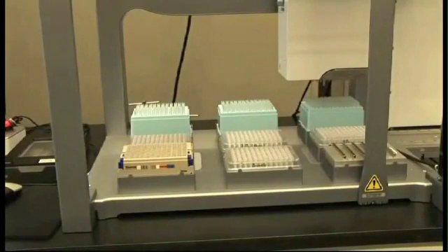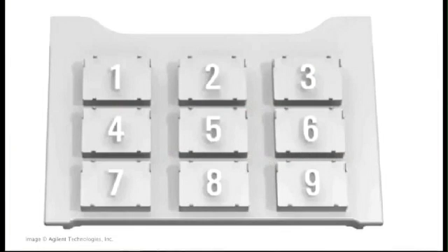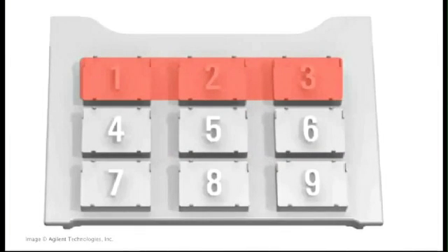What we're showing now is the automated setup for a typical 1.8x SPRIselect PCR cleanup for 96 samples. This is our typical deck layout. Across the back of the deck in positions 1 through 3, we have the tips we use for all our reagents.